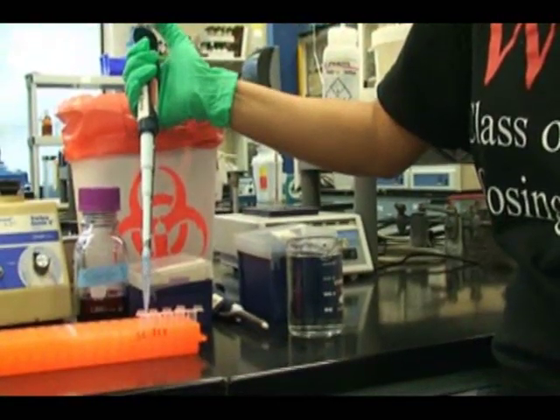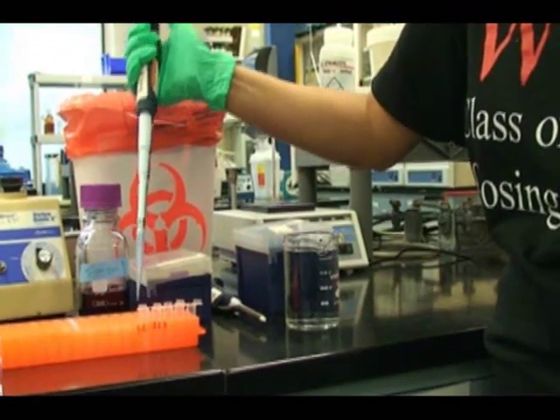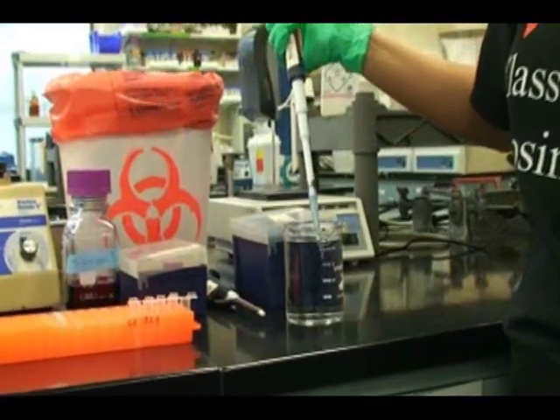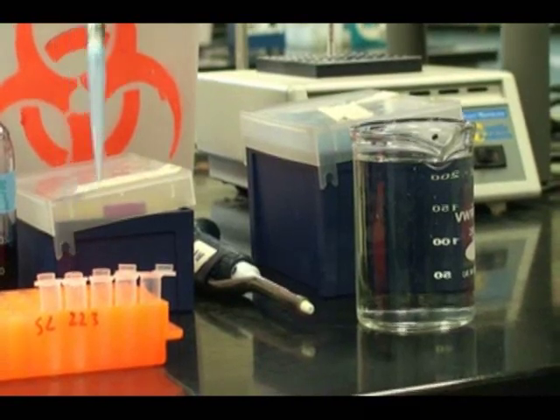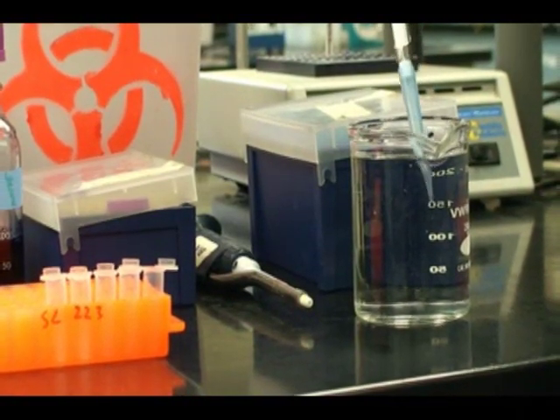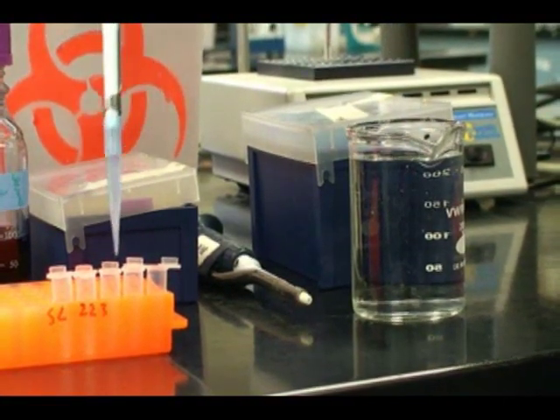The number of tubes you use will be dependent on the end concentration you want. In this example, the end concentration will be 1 out of 100,000 or down to the negative 5. So there will be 5 1.5 milliliter tubes used.